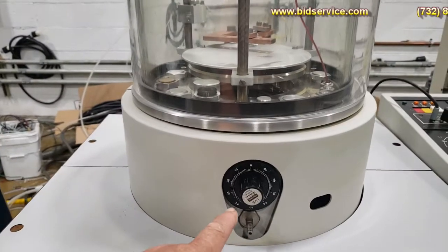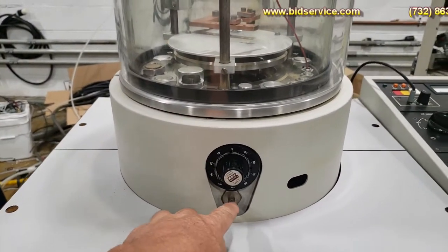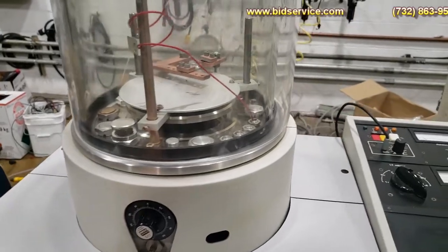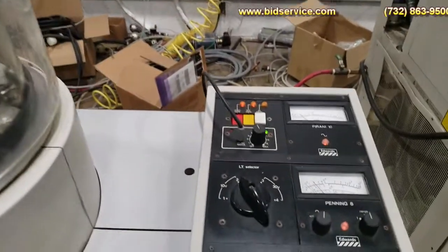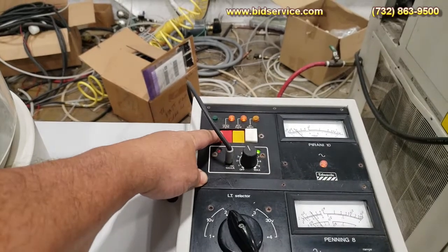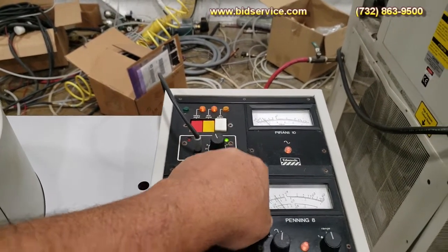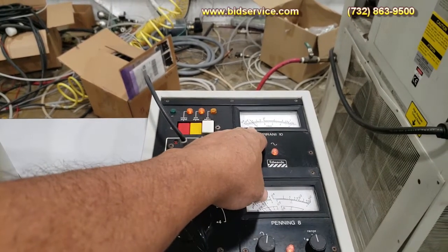On the front here you have your gas to introduce into the chamber. Over here you have your power to your rotary pump, your diffusion pump, and to vent the system. And you have your Pirani gauge which reads your fore line.